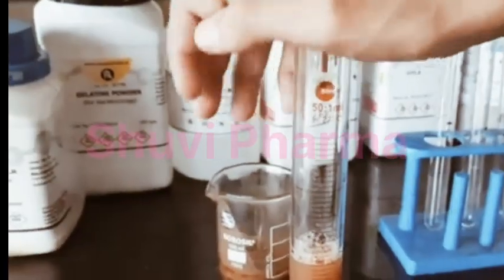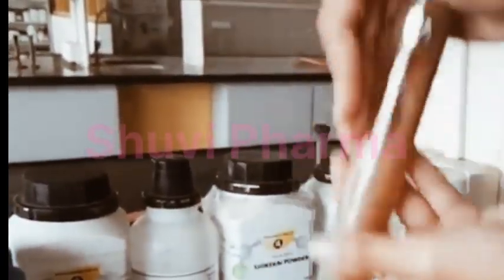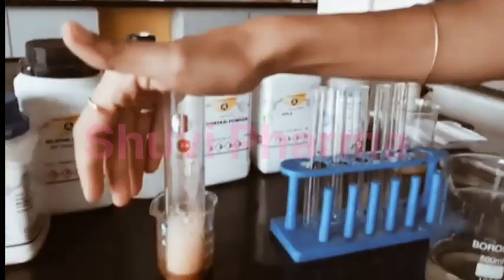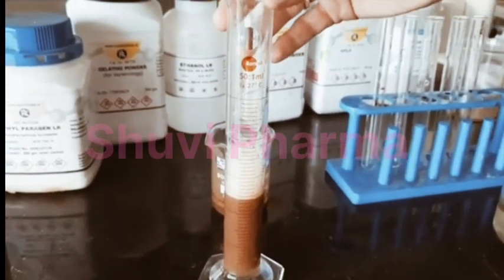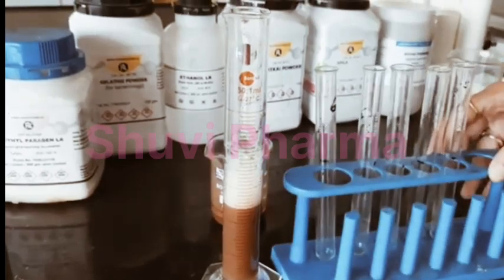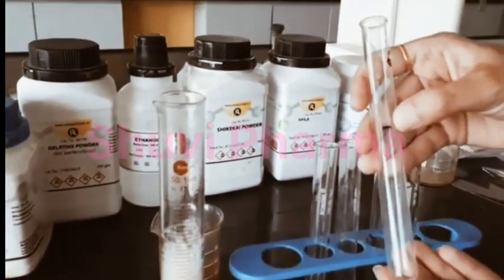Now we will shake this measuring cylinder. And from this solution, we will pipette out 1 ml in a test tube. We have already taken 5 test tubes, and I have marked each test tube up to the 10 ml mark.